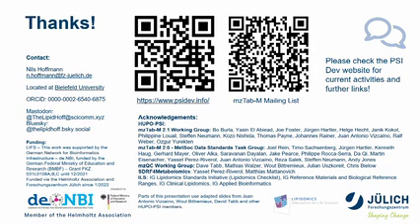Do you think some kind of integration between MZTab and the MSG common data model might be possible? It depends. We have to see whether that is possible to link out or maybe map one to the other. That's definitely a good question. And if you want to talk more about that in detail, I think it's easier to talk one-to-one on that specifically.